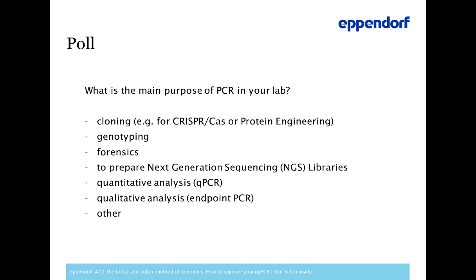So I see that the first answers are coming in. Thank you very much for sharing this. So I will read it again. What is the main purpose of PCR in your lab? Are you using PCR for cloning, genotyping, forensics, to prepare your next generation sequencing libraries, for quantitative analysis, qualitative analysis, or for something different? Just a couple more seconds.